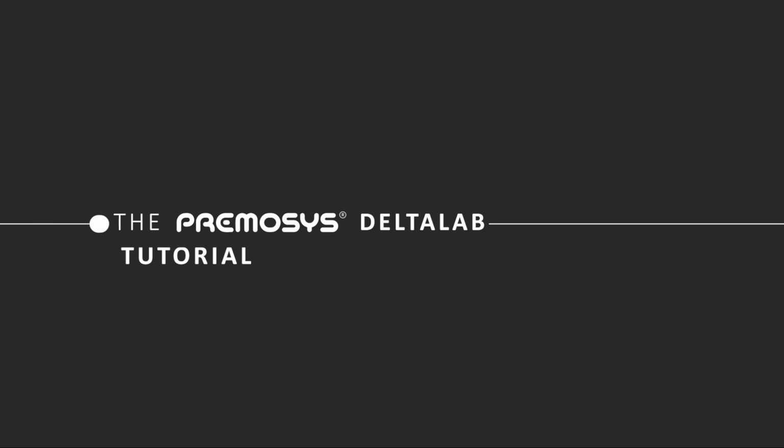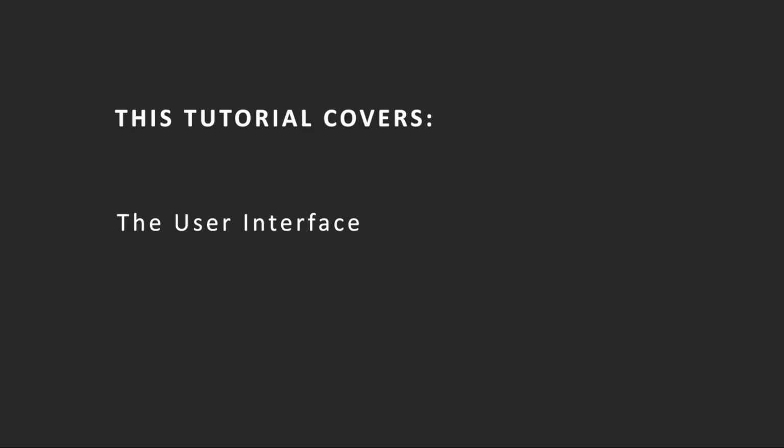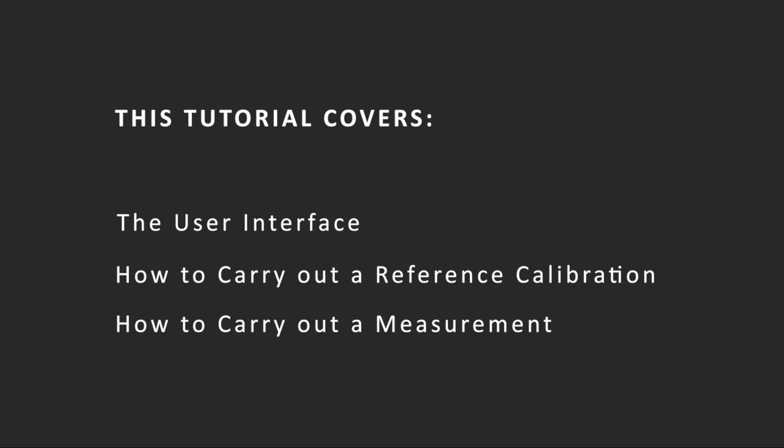Hello and welcome everyone to this tutorial about a new DELTALab color measurement system specially developed for industrial applications. This tutorial covers the user interface, how to carry out a reference calibration, and how to carry out a measurement.